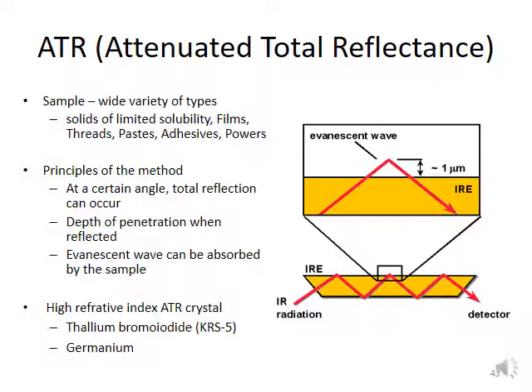So here we can see that if you have a sample of solids, like solids of limited solubility, films, threads, paste, adhesives, and powders, we can detect directly. We can analyze directly by using attenuated total reflectance.